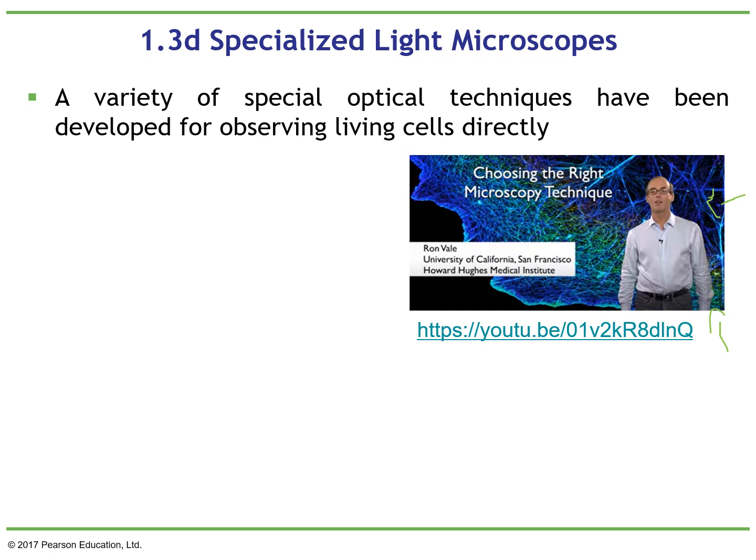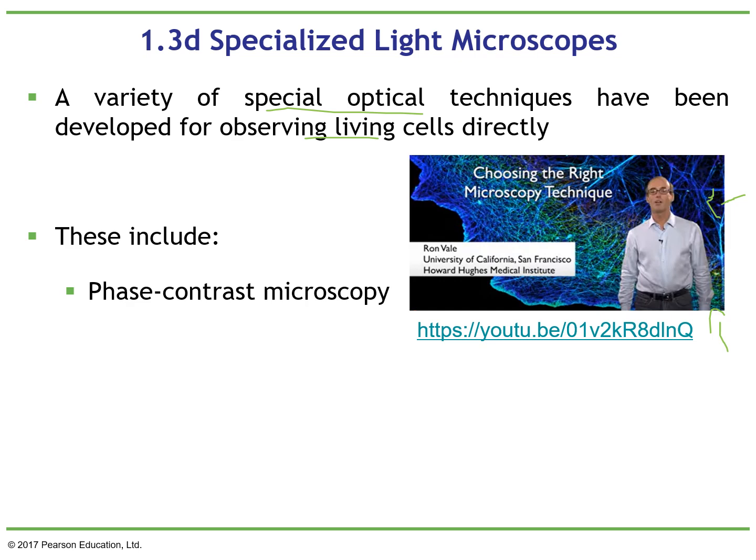So with that introduction, we have a variety of special optical techniques that have been developed for observing live cells. You might see some of my movies, and we might analyze some of them if you're interested. Some of those techniques include the phase contrast microscope, which we are going to use in the lab. We are also going to talk about fluorescent microscopy.